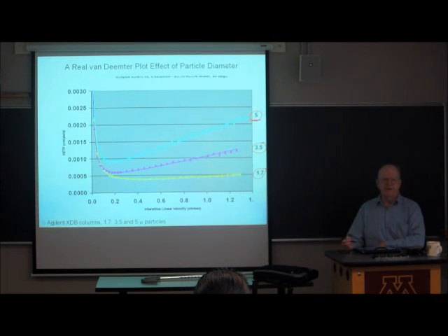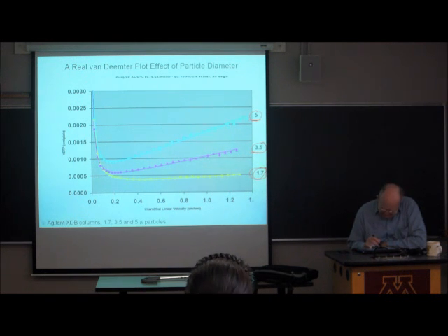This was the standard of the LC industry 10 years ago. About 5 years ago, this was the standard particle. This particle now is what's used in what we call UPLC, or ultra-high pressure liquid chromatography. What's the difference? The difference is that the minimum HETP went from there to there to there.